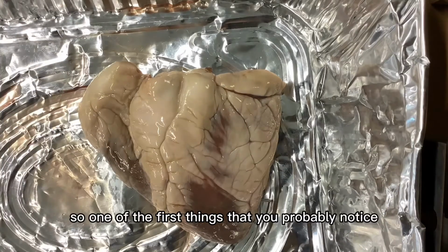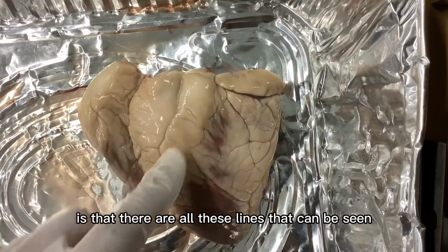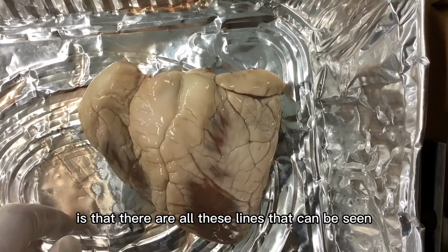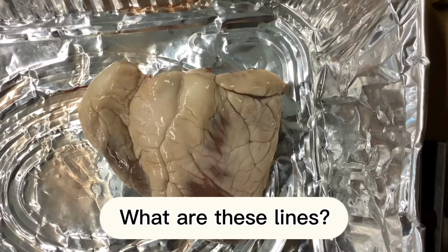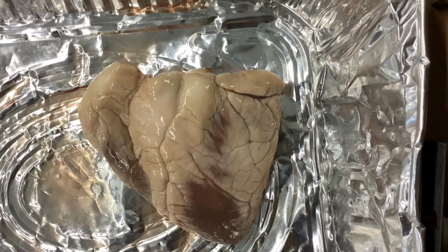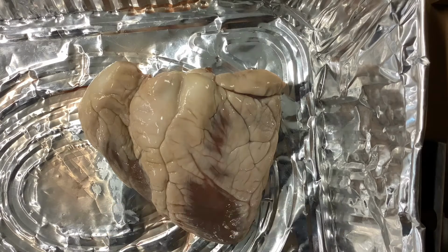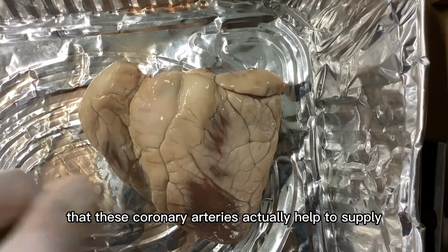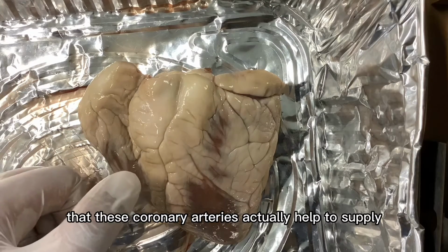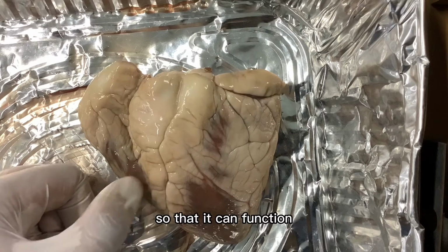One of the first things that you probably notice about the heart is that there are all these lines that you can see. So what do you think these lines are? If you have answered that these are the coronary arteries, then you are correct. You might have learned in class that these coronary arteries help to supply the heart with oxygen so that it can function.